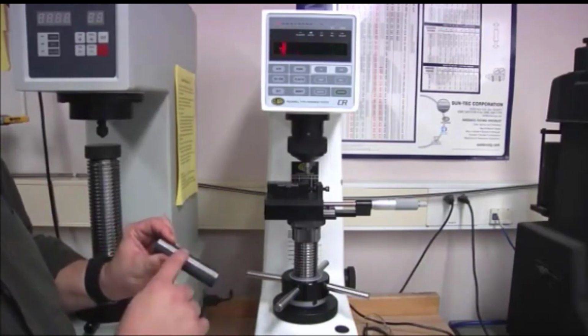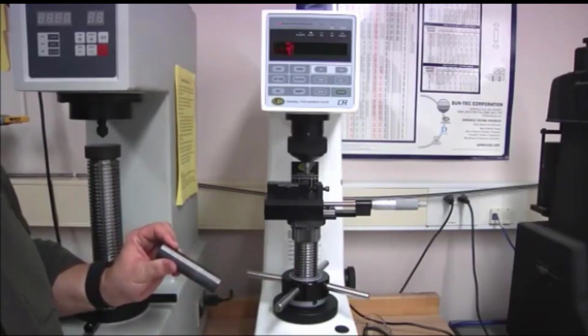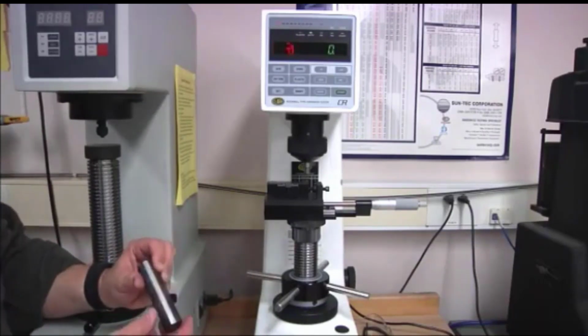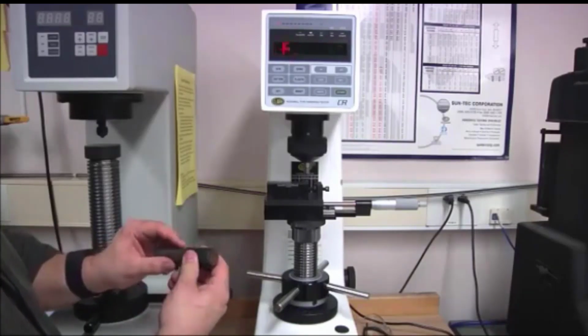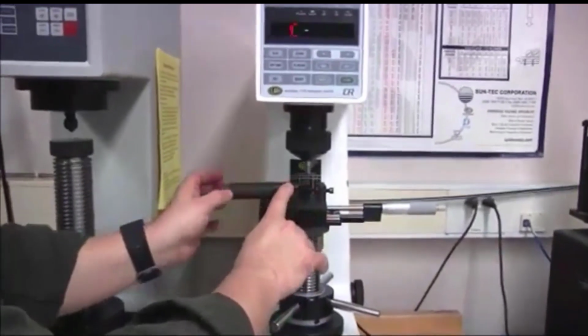The ASTM standard says that this flat should be ground. We don't have a convenient way to do that, so we machine it and just get the best surface finish that we can. So the bar, we have two flats, so the bar rests on one. I'm just going to pick the one with the better surface finish to be the side we do our testing on. So the bar rests on one flat.